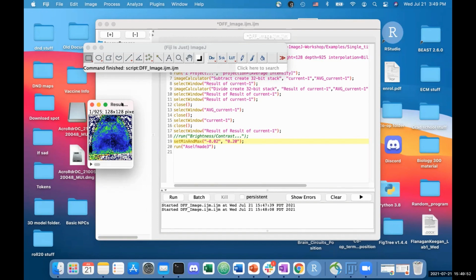Yep. So can I go in and use just choosing stuff off menus to edit this, or that's not possible? So what I've done in the past to deal with the situation you're describing, let's say we left out a step, like we forgot to do the scaling and we really wanted that in our macro, is just record another macro with those few steps that I want to add, and then copy and paste that code into the right place in my larger macro. Oh, smart. Okay. Does that make sense?